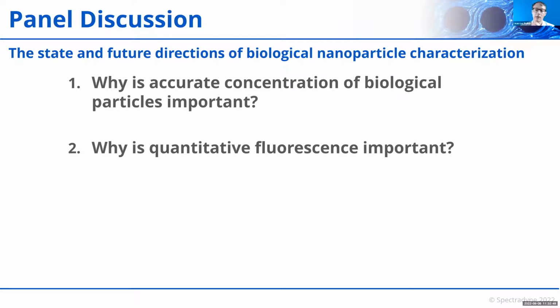Is that something that's done with conventional flow cytometry for larger particles? Or are the numbers too big for that? It's done, but it's very specific. What I rather see in the literature is that people stay with units like ERF and MESF just to have their assay reproducible. To go to the number of receptors, you really have to go into details of your own assay and reagents that you are using.